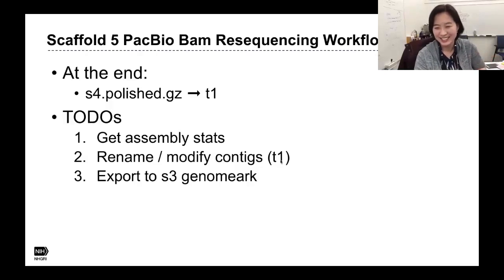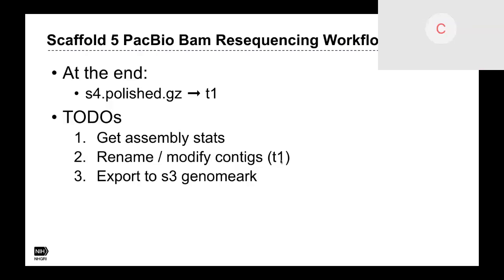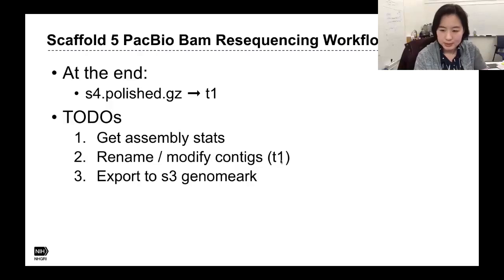I see. It was specifically designed to error correct the Hi-C inversion errors that you can frequently see when you have small contigs run through Hi-C scaffolding without any other scaffolding steps. But the Hi-C was run afterward, right? So that actually is not applicable in our pipeline, is it? Yeah, the only benefit I think will be that it will better detect inversion errors that were placed by either Falcon or Scaff10x. I see.